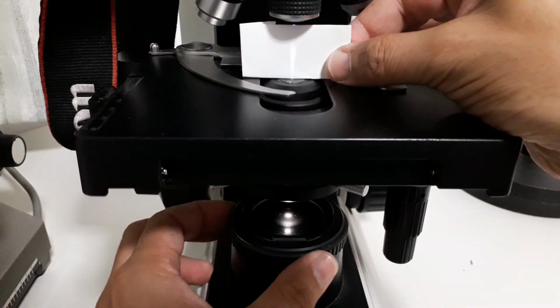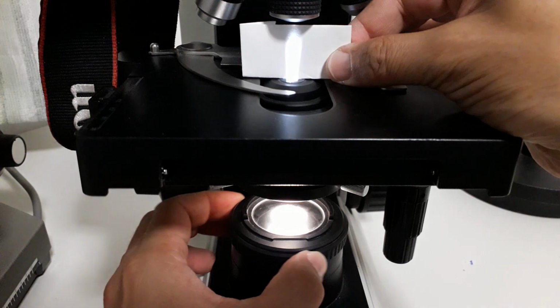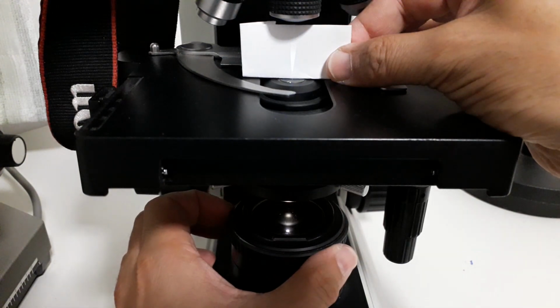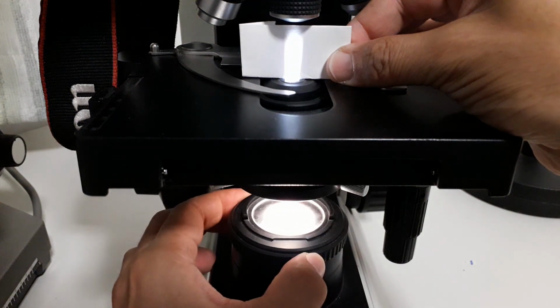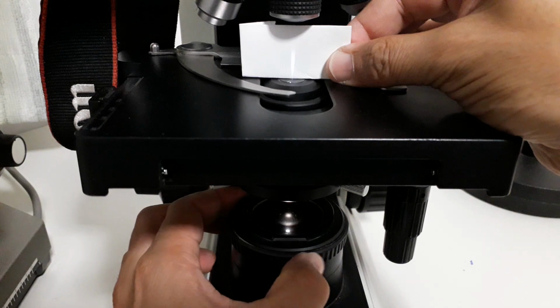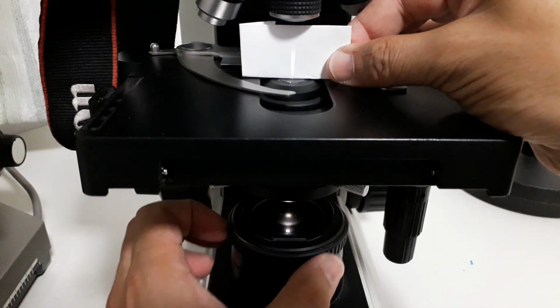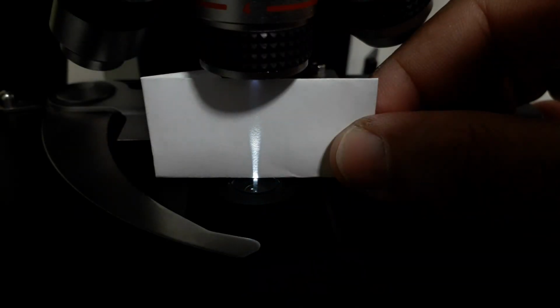So I'm now opening and closing the Köhler field diaphragm, and you can see that the light beam which exits the condenser at the top, where I placed a piece of paper, changes in its width. So opening and closing the field diaphragm opens and closes the width of the light beam, but does not change the angle. Here is a slightly closer look, and you can see that the light beam becomes wider and thinner.